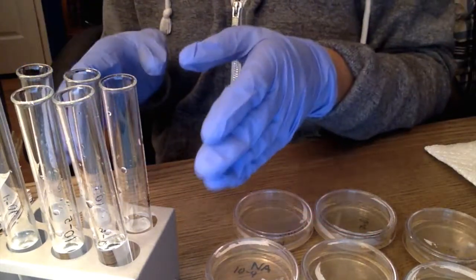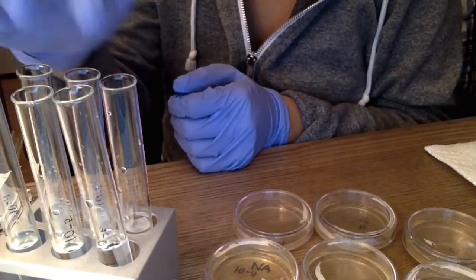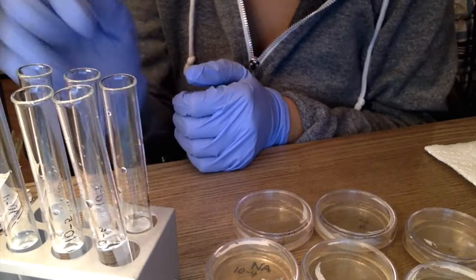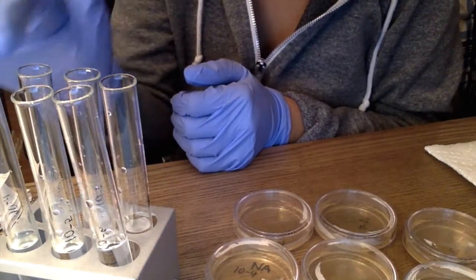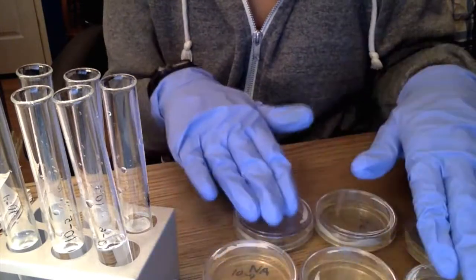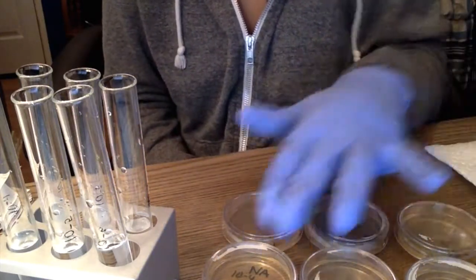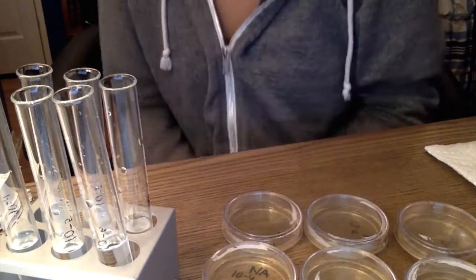I added 2.25 milliliters of distilled water here in these tubes, these 6 tubes, which I have labeled 10^-1 up until 10^-6. Now these tubes also have corresponding agar dishes here, so I have 10^-1, 2, 3, 4, 5, 6.